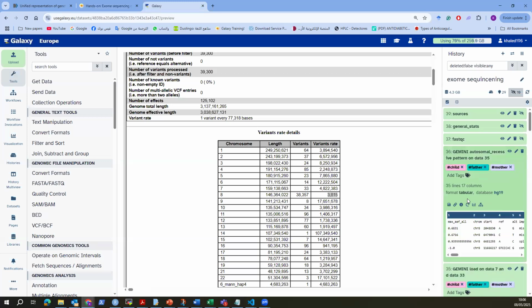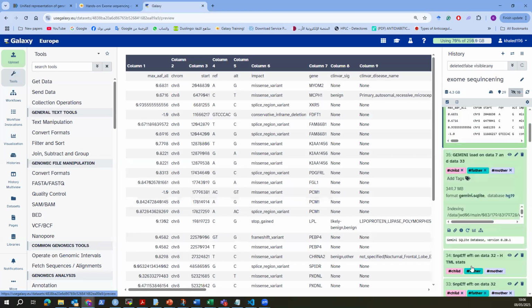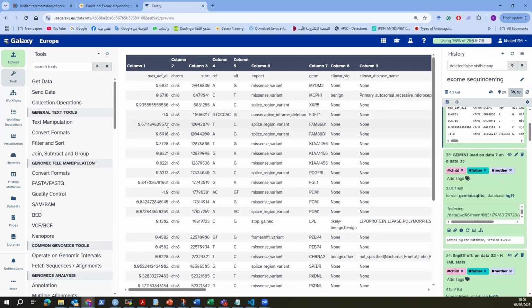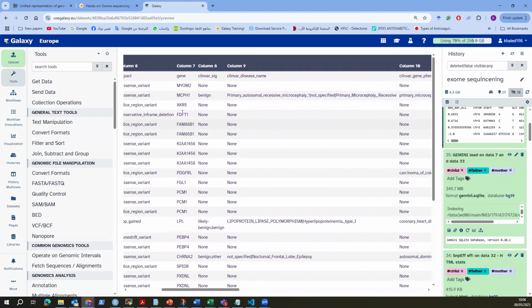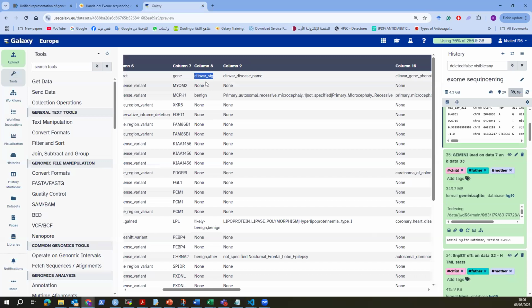To check that, you go to create a tabular file, to get multiple files in a different format, so to work with that, but with SQL. So this is the code, the tabular form of the data we have here. It shows the chromosome, the start, the reference, the alteration, where the gene is located, and also the output of the ClinVar significance. Some of those have no effect, or no data, and then you get benign, likely benign, pathogenic, likely pathogenic.